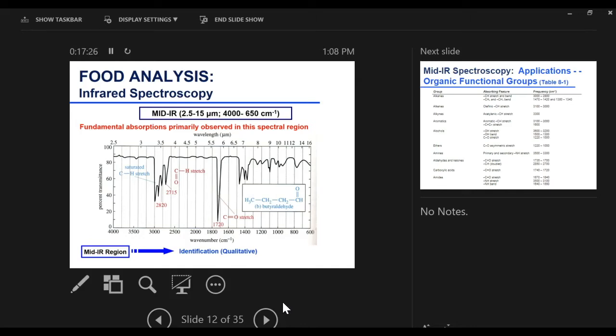The lower the concentration of a certain functional group, the higher the transmittance. The transmittance is for any wavelength, or energy, that was not absorbed, and that's what the IR is measuring. It's measuring percent transmission. And the x-axis is not necessarily wavelength, it's wave number, and the unit is centimeter to the -1.